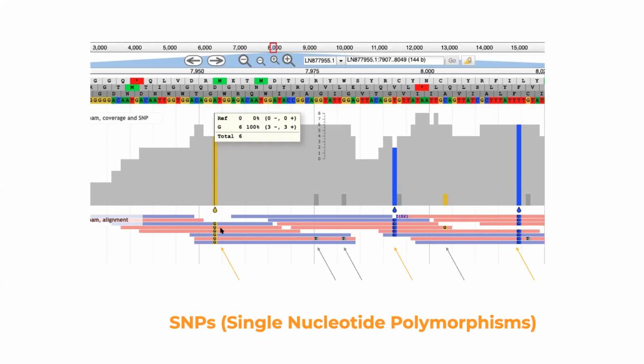The red and the blue, right, they're positive, negative, because we have what's called paired-end reads. Okay, what are paired-end reads? Paired-end reads are reads that are sequenced from both ends at the same time. So there are single-end reads and paired-end reads. Single-end are just one direction. Paired-end, they take each segment when it's shattered and they sequence from both sides. Okay, so that's why we have blue and red.